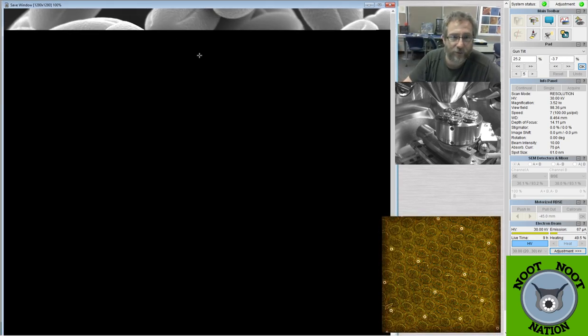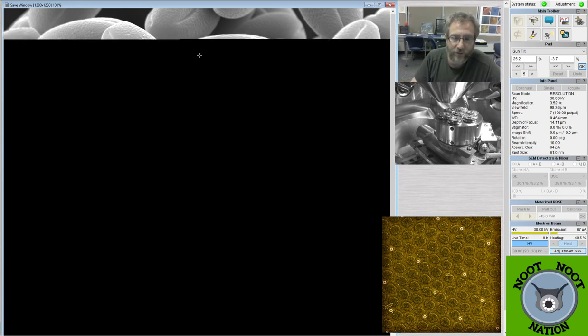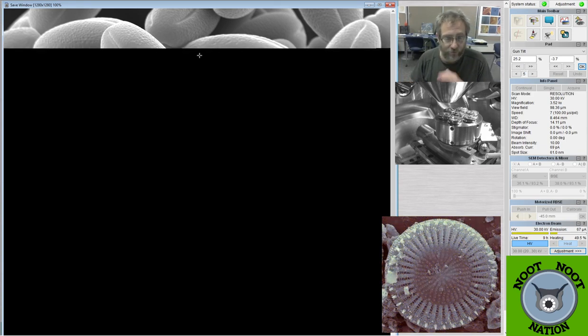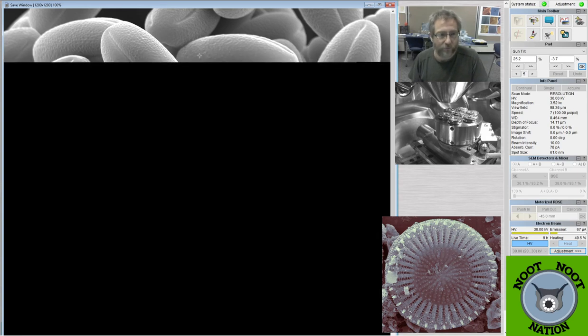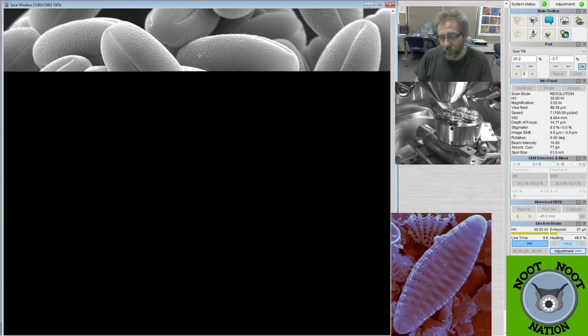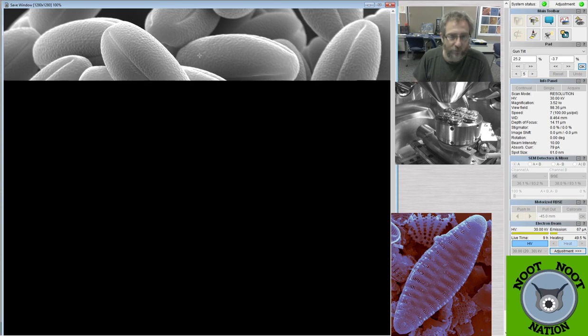So I look at lake sedimentary samples, and the pollen that's windblown, and some of it that's insect carried, will end up in the water and then fall through the water and end up in the sediment. So when we do paleolimnology, which is the study of ancient lake sediments, a lot of times pollen is captured. And while I don't study it directly, I have friends who are palynologists who study pollen. I mean, it's not all they do, but it's primarily what they do.